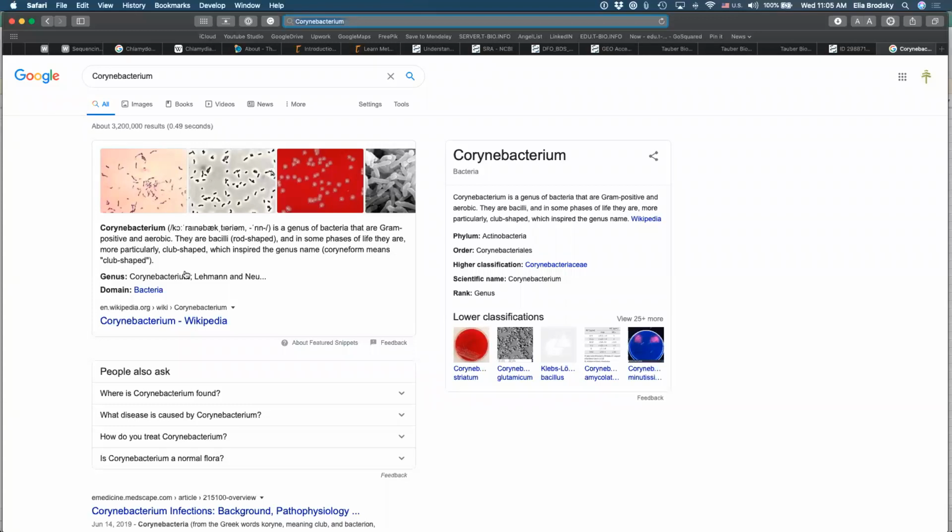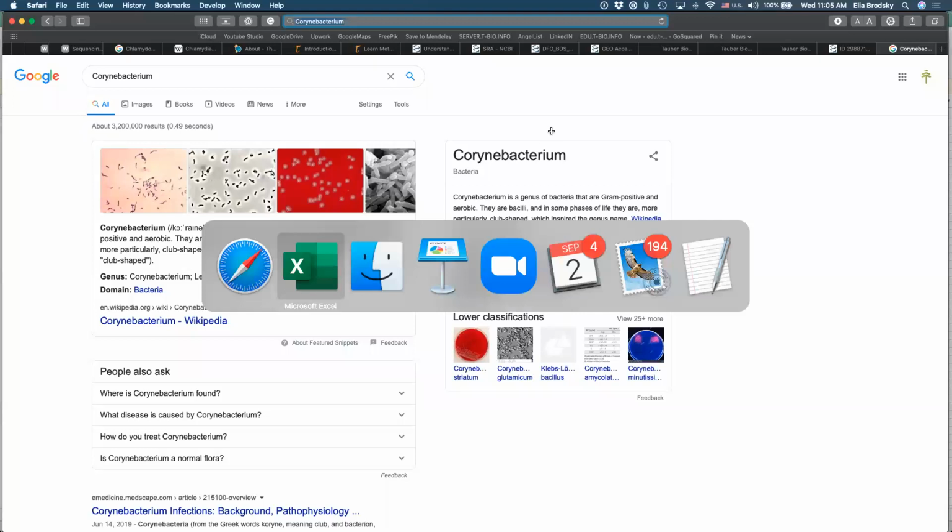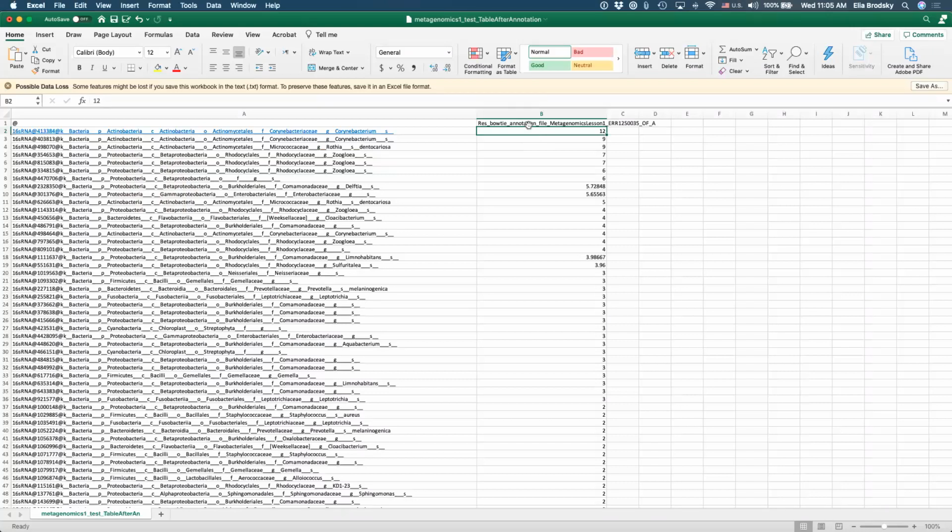What does this tell us about this sample, right? So it's a question of what it could actually tell us, but the interpretation, the very immediate, simple interpretation from this is that in this particular sample, and we don't know right now anything about the sample, who it came from, or what phenotype is associated with it, but in a very basic way, we can see that there are several members that are highly enriched compared to other ones.